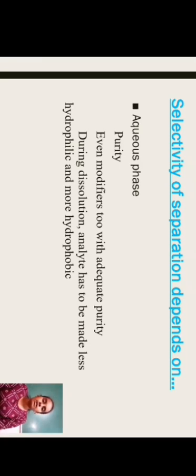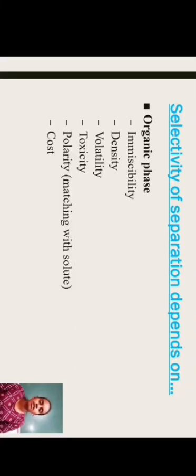In solvent extraction, selectivity of separation depends on the purity of the aqueous solvents, even modifiers with adequate purity. During dissolution, the analyte has to be made less hydrophilic and more hydrophobic. Selectivity of separation also depends on the organic phase: immiscibility, density, volatility, toxicity, polarity and cost.